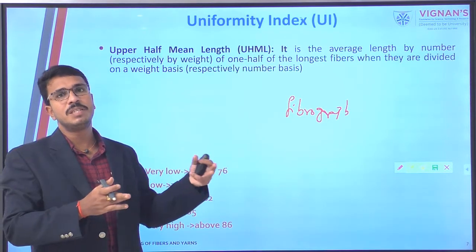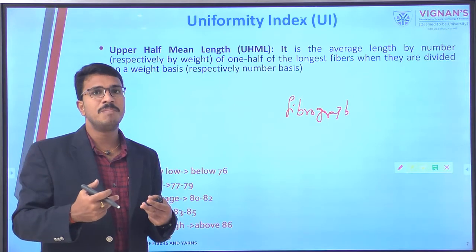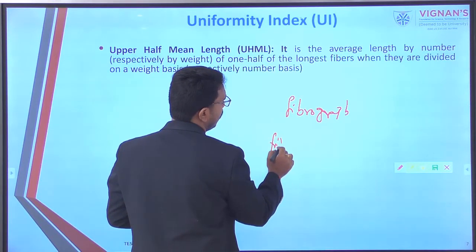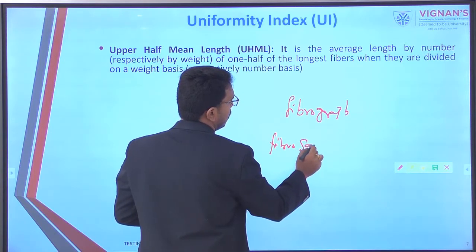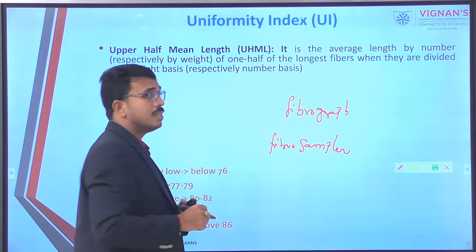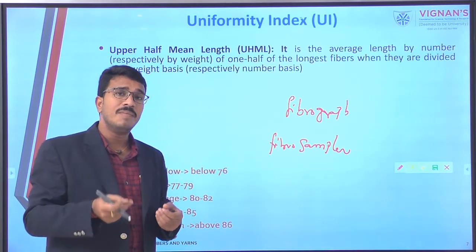The fibrograph is inbuilt, and we are preparing the fiber samples by using the fibro sampler.